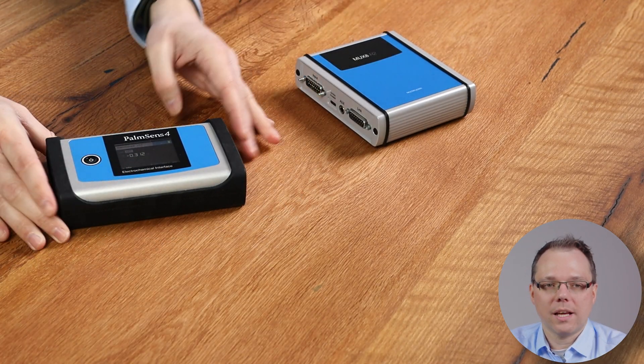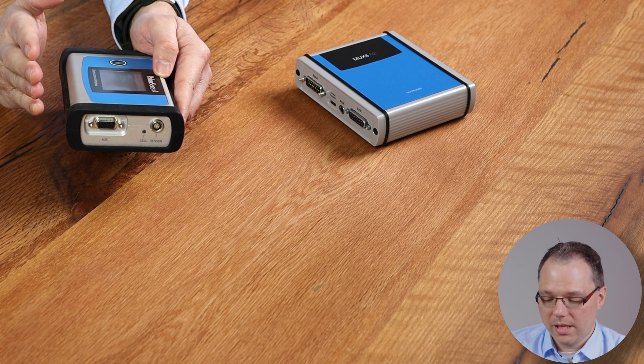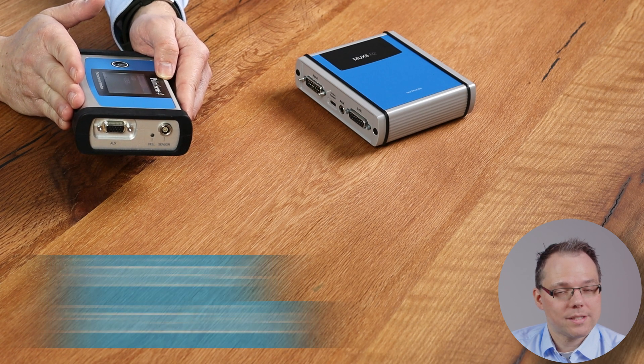Let's first have a look at how we connect it and what different options there are for connecting your cell. Let's say I have my Palmsense 4 and I would like to connect it for a longer overnight automated measurement — so I want to connect up to two cells. Important: the potentiostat you want to use needs to have an auxiliary port. At the moment we can offer the Palmsense 4 or the Emstat 3 Blue with auxiliary ports. These are the potentiostats that are compatible with multiplexers.